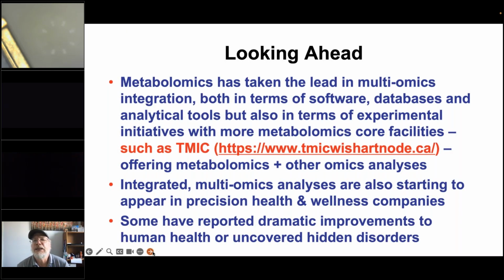So I think metabolomics has helped take a lead in multi-omics integration, whether it's through the tools I've highlighted, like HMDB, PathBank, MetaboAnalyst or MiMeDB. This comes from software, databases, and a variety of analytical tools that have been developed.